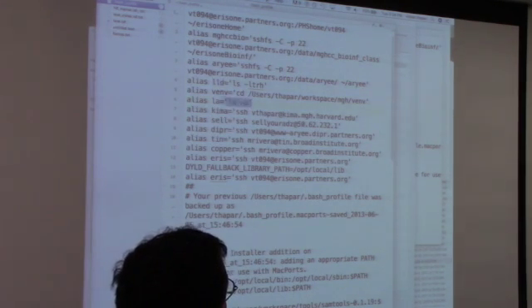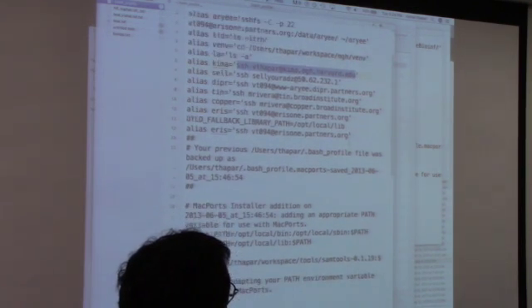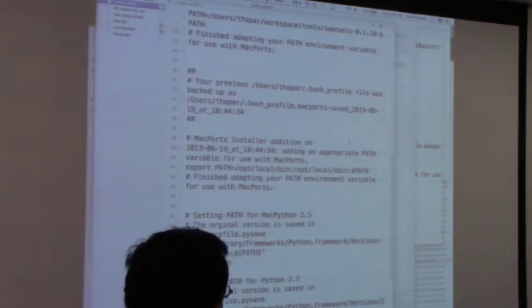For example, if I want to just do an la, or if I want to connect to another server, Kima, then I can just connect like this. So these are all my servers and everything that I can connect to, but that's mine, so you don't have to worry about it. Alright? Okay, once you do that, save it and exit.